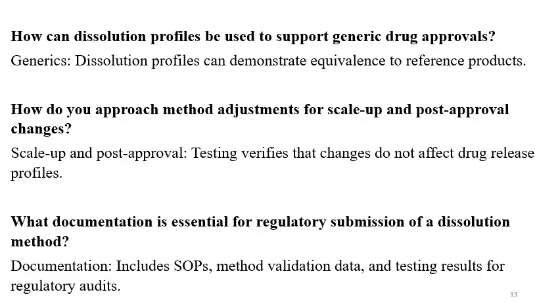How can dissolution profile be used to support generic drug approvals? Dissolution profile similarity is required to be demonstrated to justify equivalence to the reference product. How do we approach method adjustment for scale up and post approval changes?